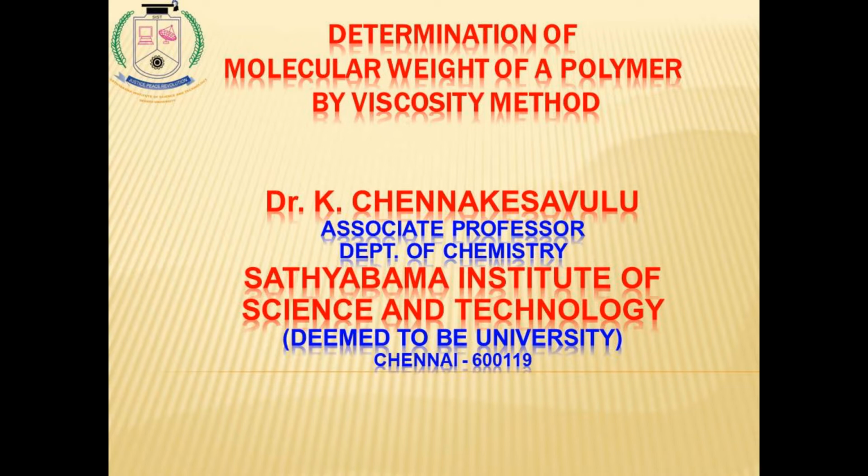We are going to find the molecular weight of polyvinyl alcohol by the viscometer method. This viscometer works based on gravitation only, by the gravitation principle.